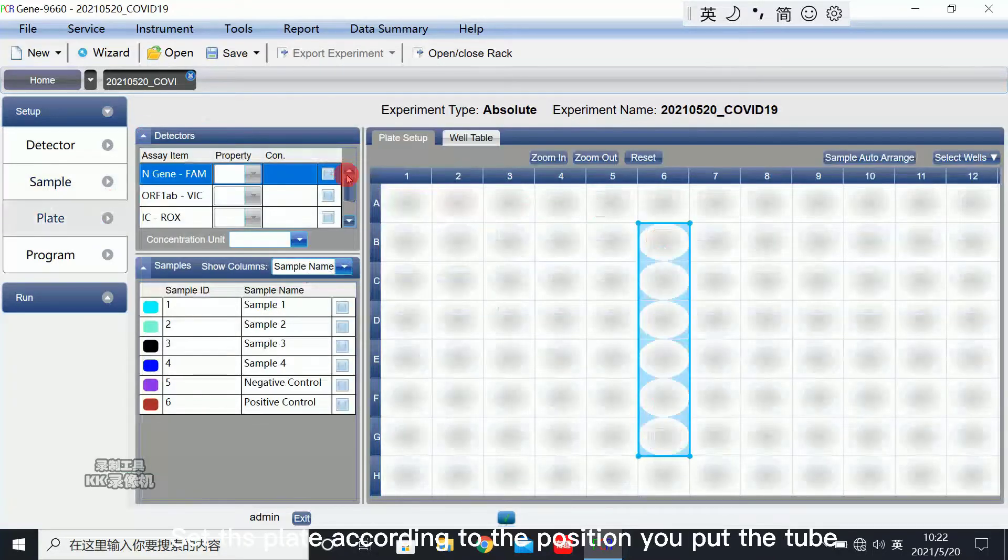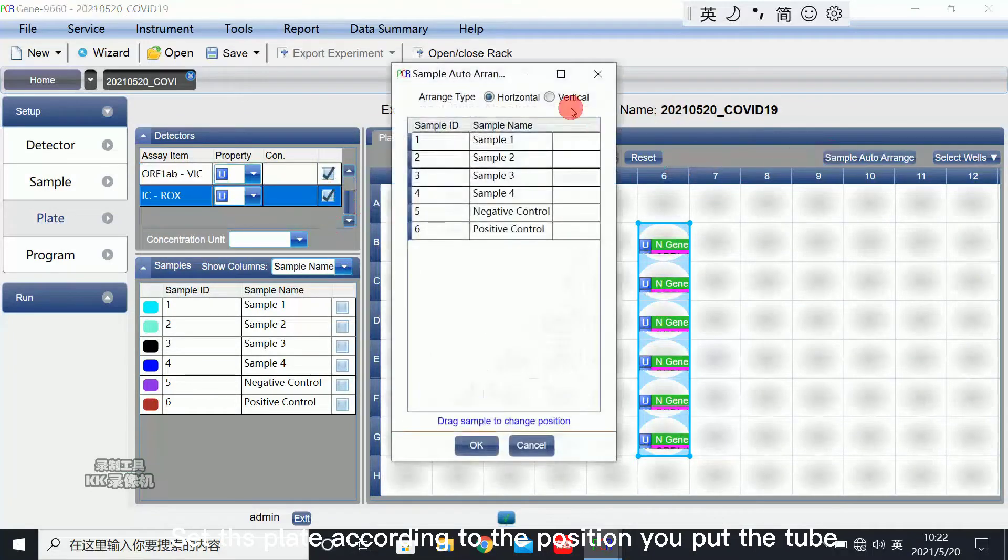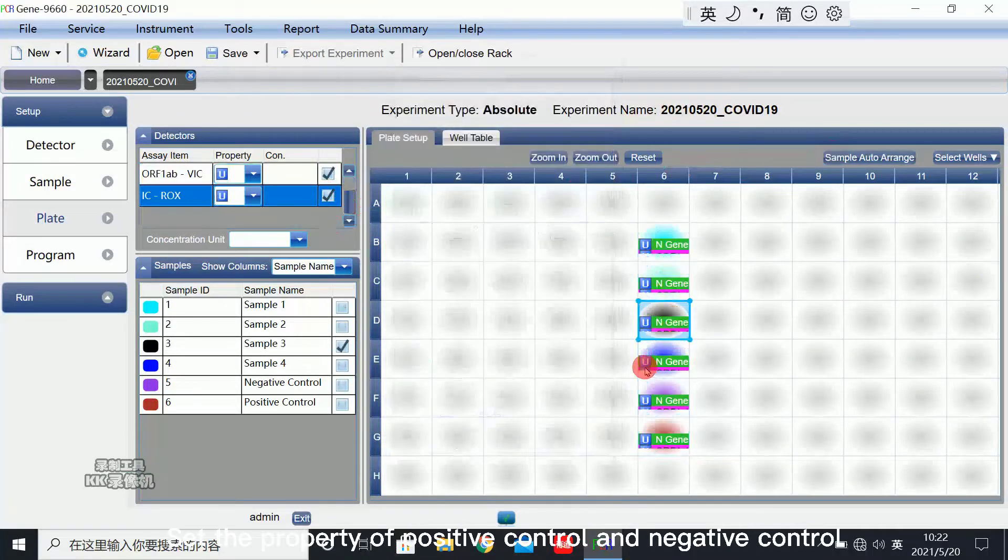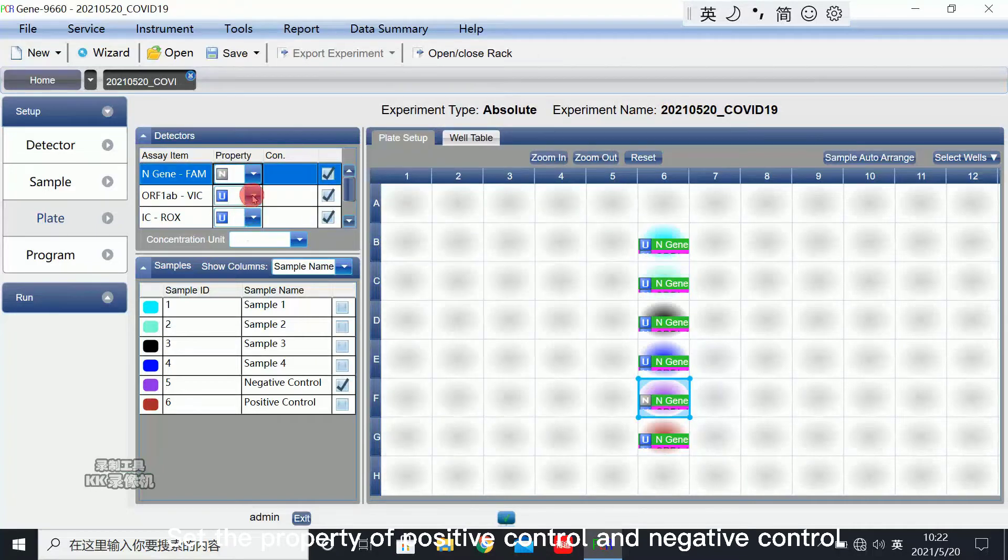Set the plate according to the position you put the tube. Set the property on positive control and negative control.